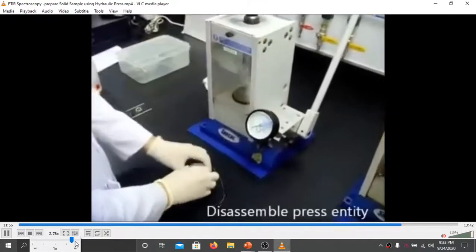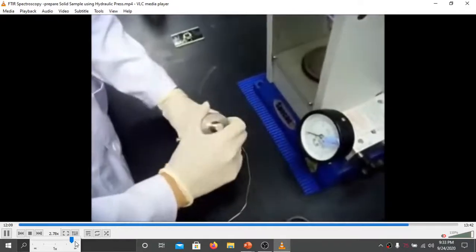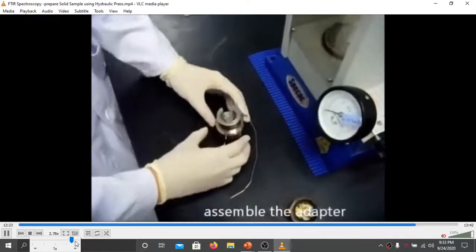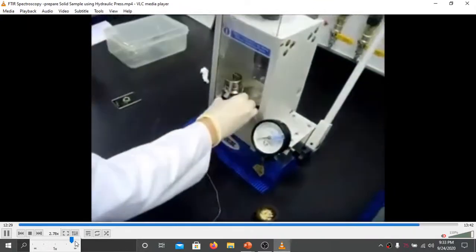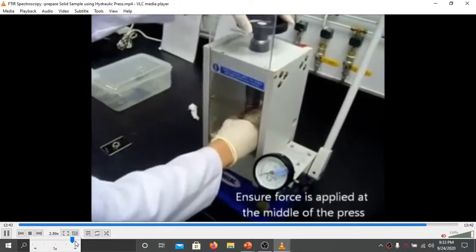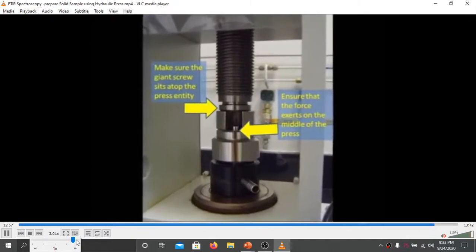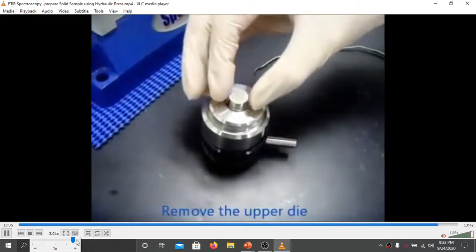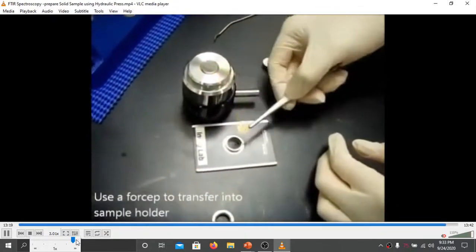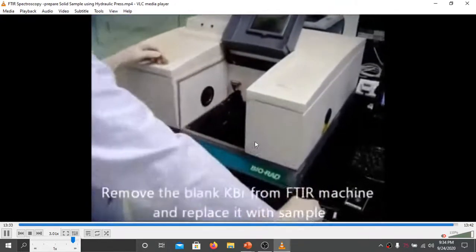Turn the wheel to remove the dies and punches. Again invert this die device and place the adapter for removing. Again keep it into the hydraulic press, apply the pressure, and remove the sample disc slowly. Place the sample disc into the sample compartment, screw it, fix the cap and place it into the instrument.